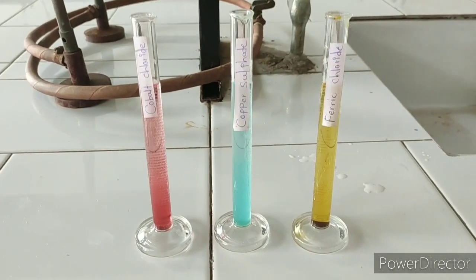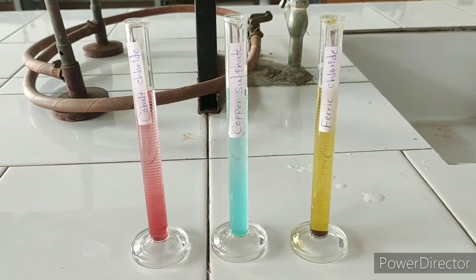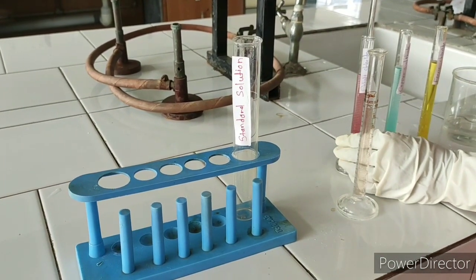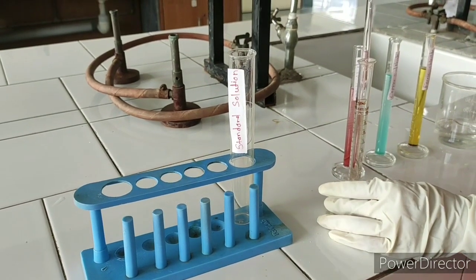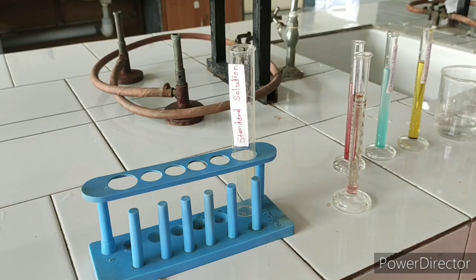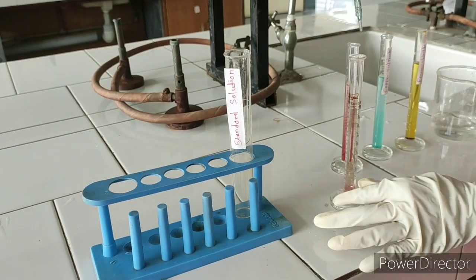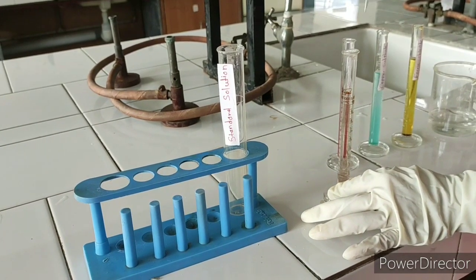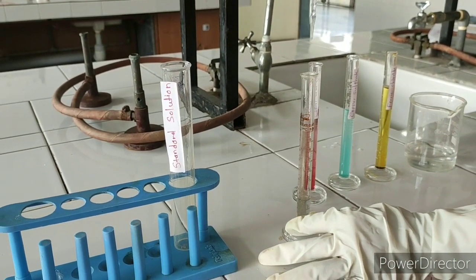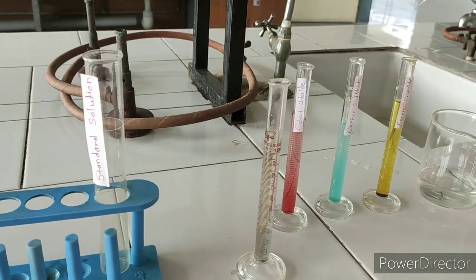We have already prepared stock solutions of cobalt chloride, copper sulfate, and ferric chloride — 10 ml each, as per IP. Next step: take 1 ml of cobalt chloride solution, then 2 ml of copper sulfate solution, then 3 ml of ferric chloride solution.